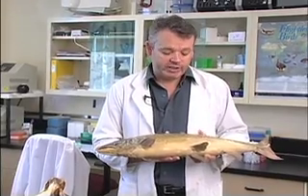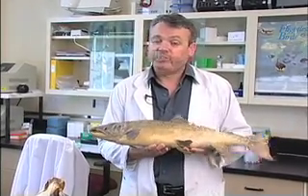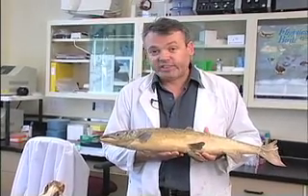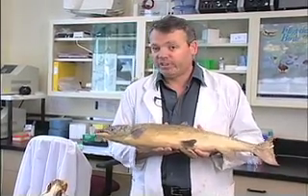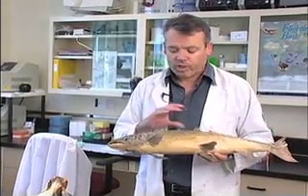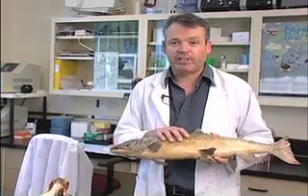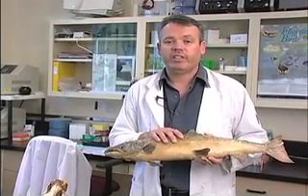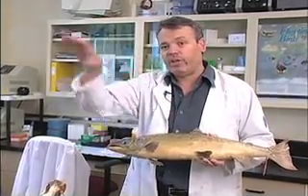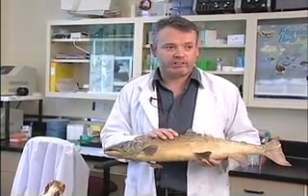So what we're doing here in the DNA lab is that the museum has 6 mounts taken from the 1800s. And we've succeeded in recovering DNA from these particular mounts and are now using those DNA patterns to find out if any of the fish that are descended from Lake Ontario still exist, because prior to them going extinct, eggs were taken around and used to stock other lakes and rivers.